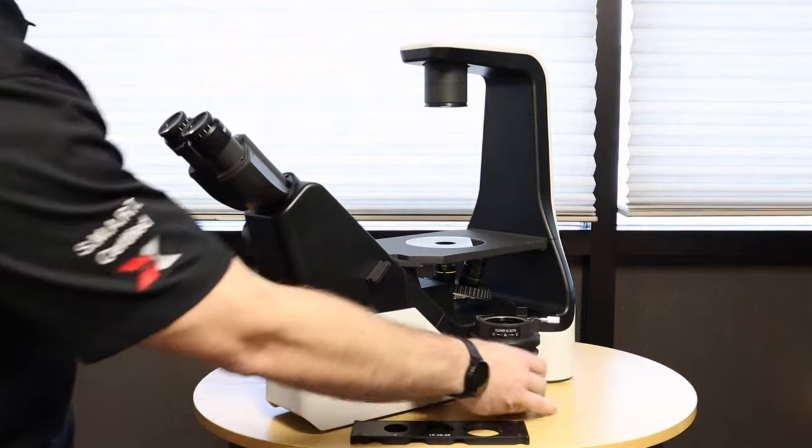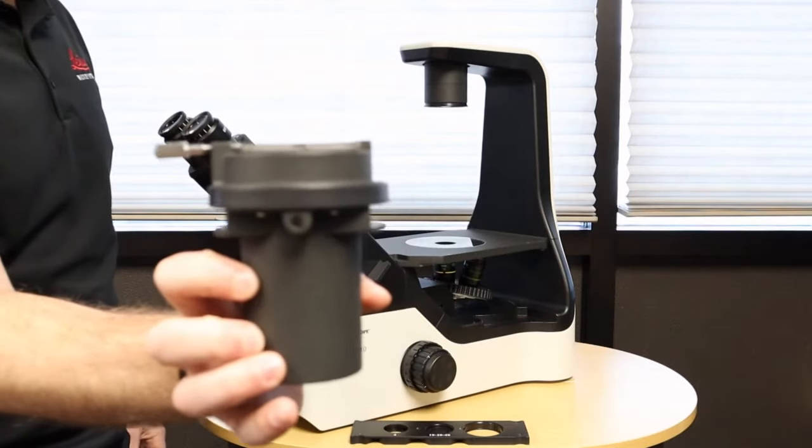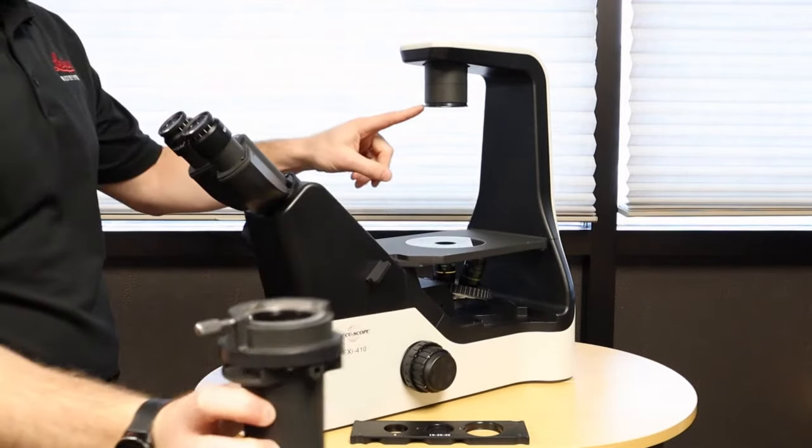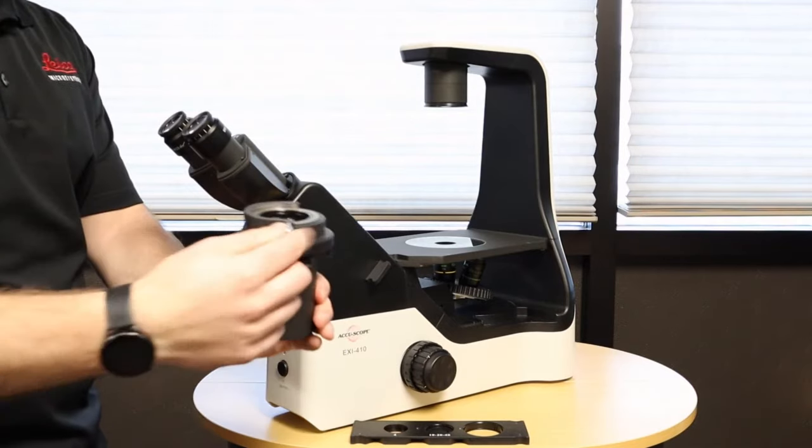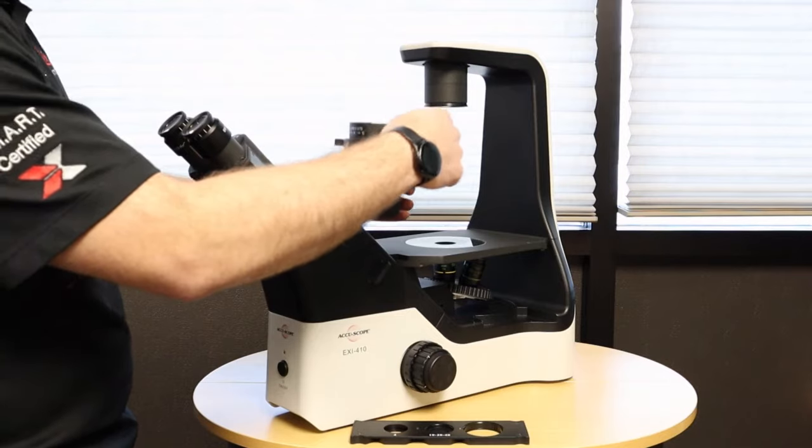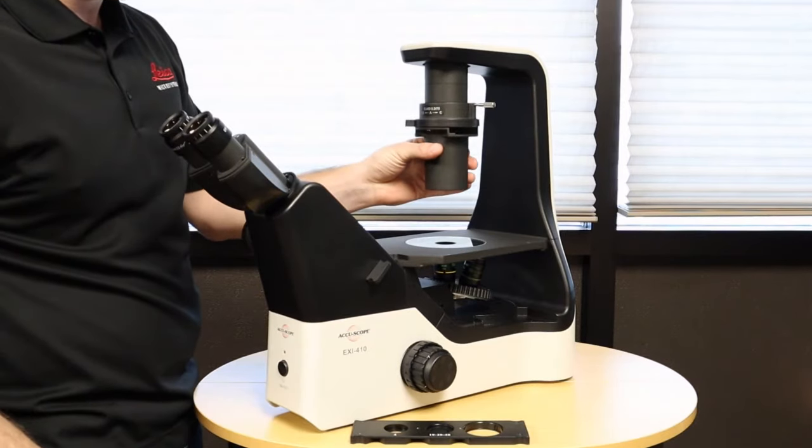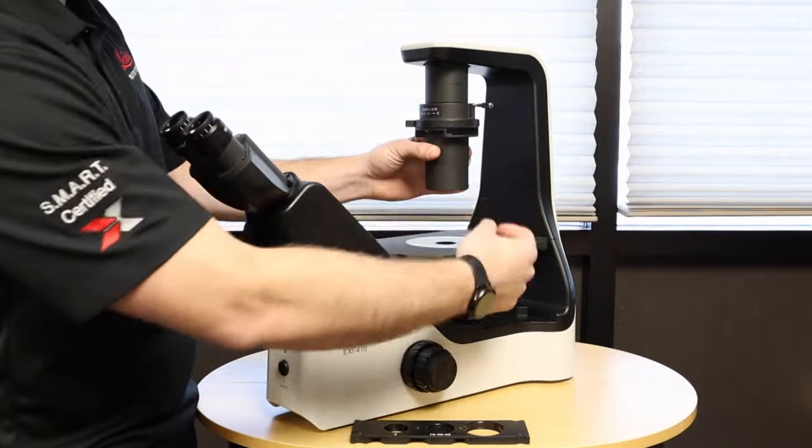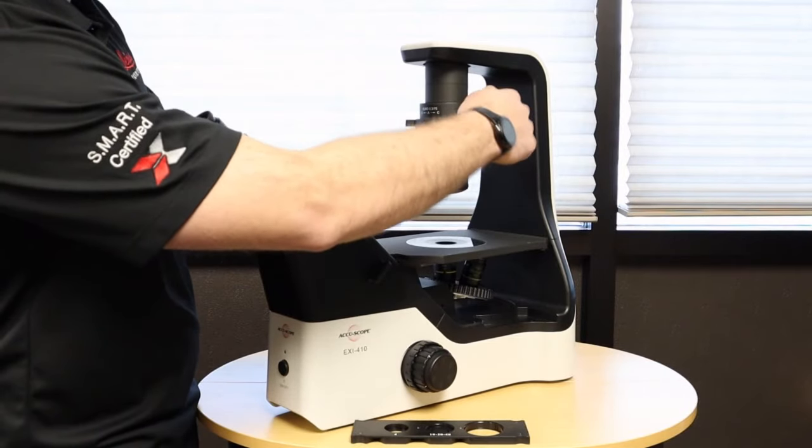The next part is going to be what is called the condenser. The condenser, as you can see, slides onto the flange mount here and locks with this thumb screw. So we simply loosen the screw, slide it onto the flange, straighten it, and then simply tighten the thumb screw.